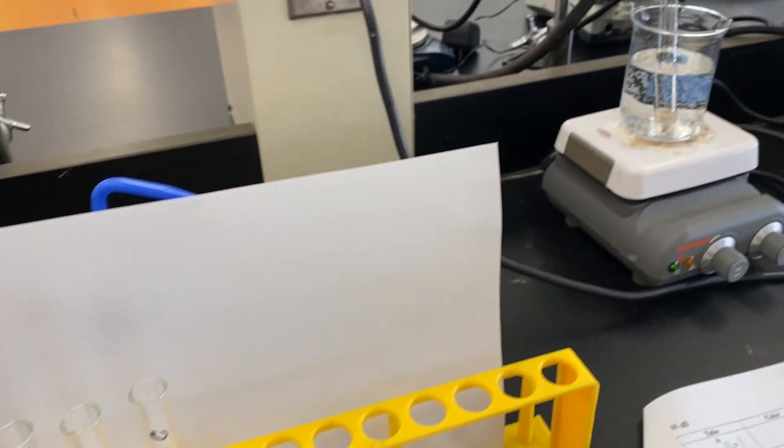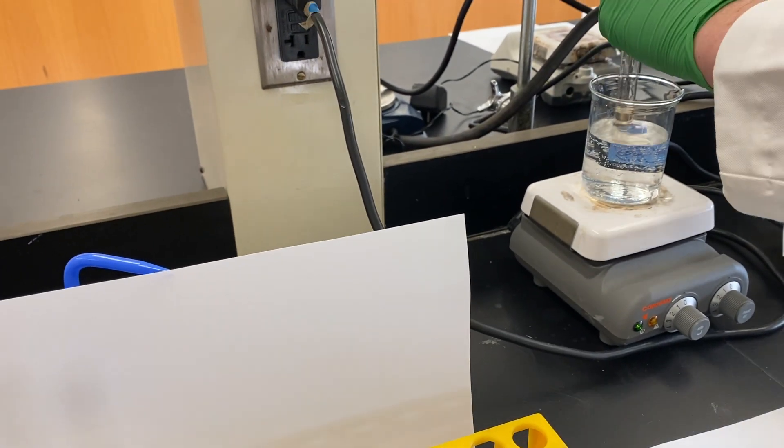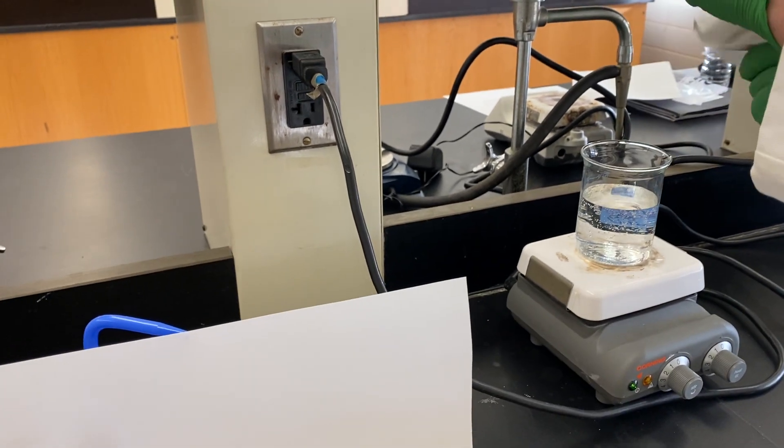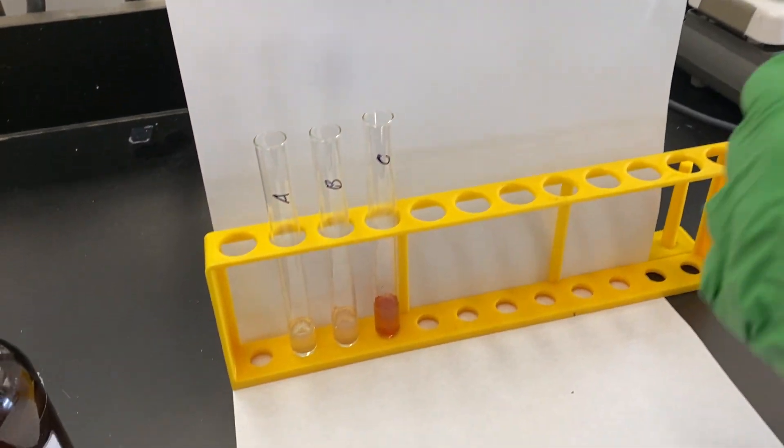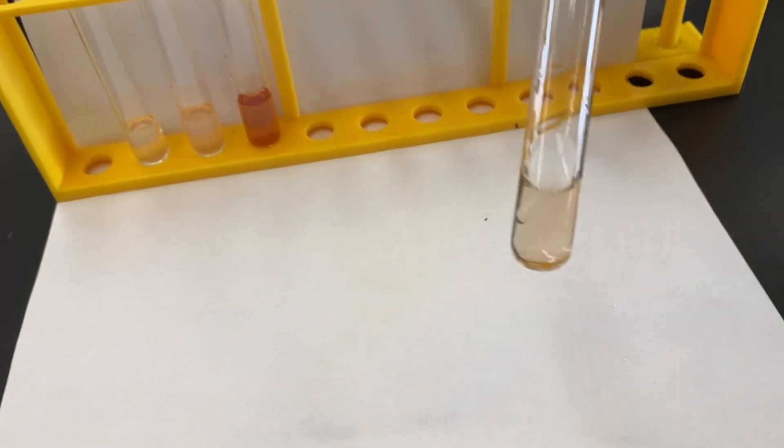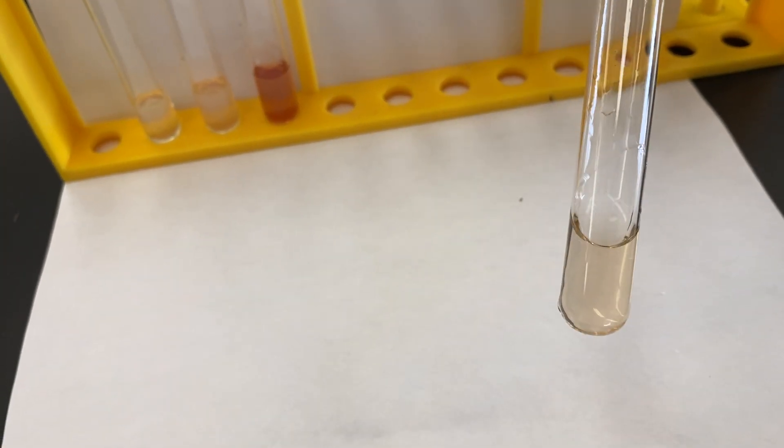Isn't that nice? Last one, test tube D. We're looking at the tyrosinase, your catechol, and sodium carbonate, pH 9.